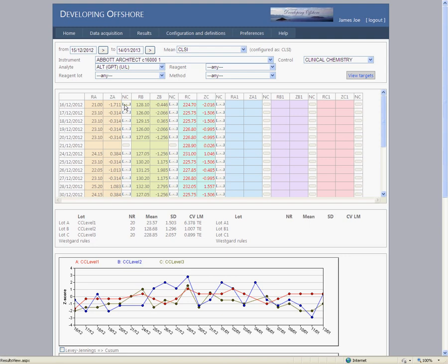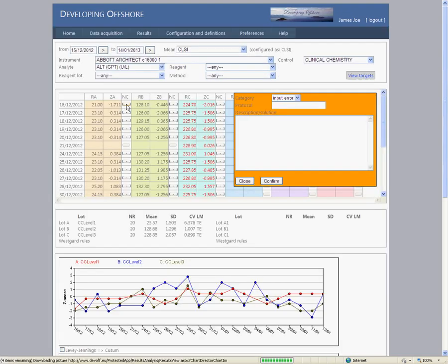This is for nonconformity. Click on the button and you may exclude this result by selecting a nonconformity category. You write a protocol, the description of the solution, and you just confirm. From now on, the result will be excluded from your results.